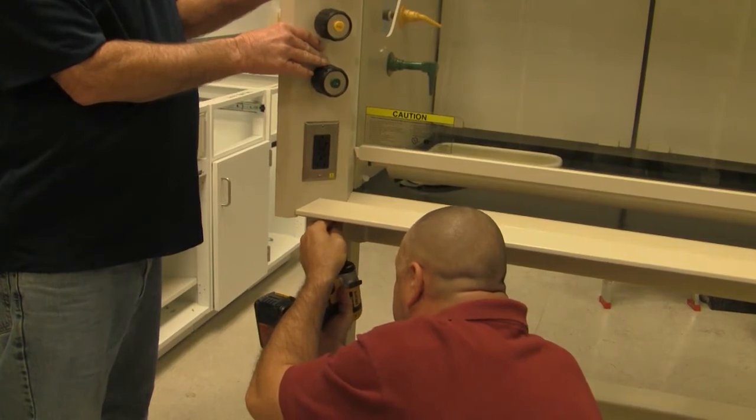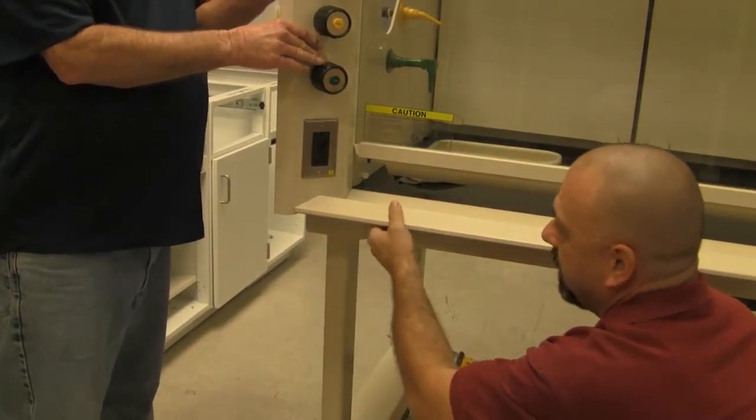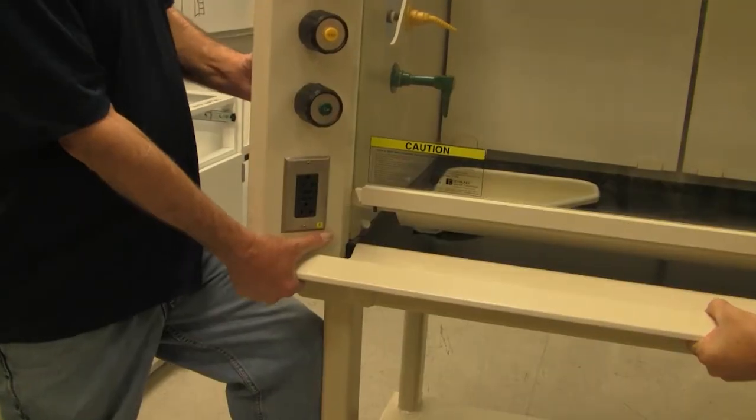Remove the screw on one side of the airfoil that holds it to the side of the hood. Then pull the side of the hood until you have enough space to remove the sash.